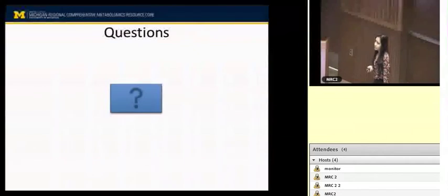Is that completely randomization or do you have other tricks? It's not complete randomization, right? You have to block for certain things. You block first on certain levels, based on the study design. Say for example, I have 200 samples and 5 or 6 different factors. First I have to know what the instrument capacity is. Per run, how many can I run? If I can run 50 at once, then I need to decide how I'm going to distribute all those factors. And I don't want one factor altogether in one batch, right? So you need to take care of those things before you decide. Not always completely randomize.